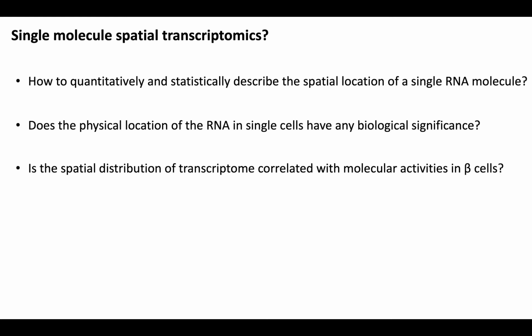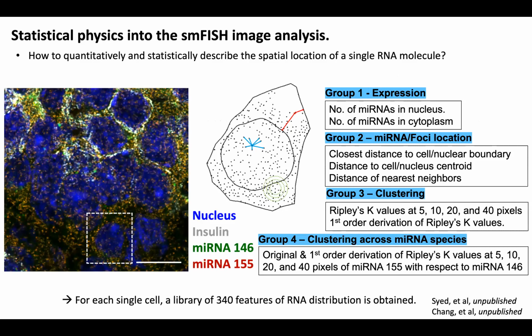How is that correlated with the cellular functions in the beta cell? To first answer this, we came up with a quantitative approach. To do that, we developed a very comprehensive and systematic evaluation of the spatial distribution of each RNA molecule in a single cell.